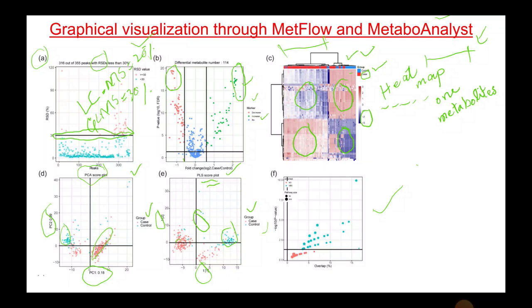These were generated through Metflow, and this software is also free. Like MetaboAnalyst, you can create a free login for this website, upload your metabolites list, and do all these analyses by yourselves. Now I can also show you some graphical visualizations generated through MetaboAnalyst on the next page.